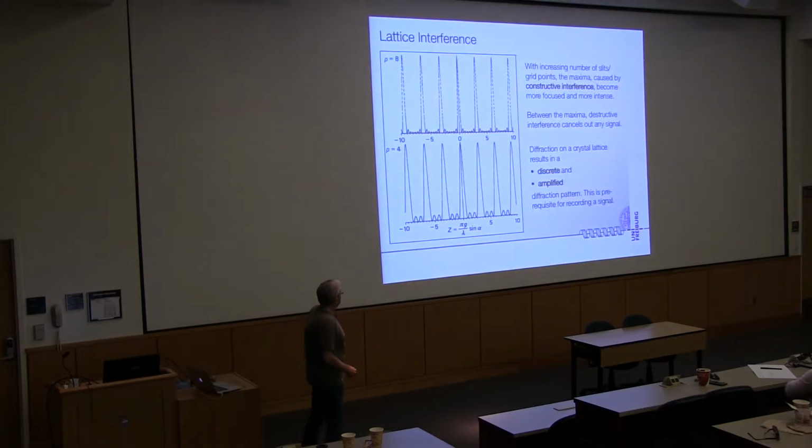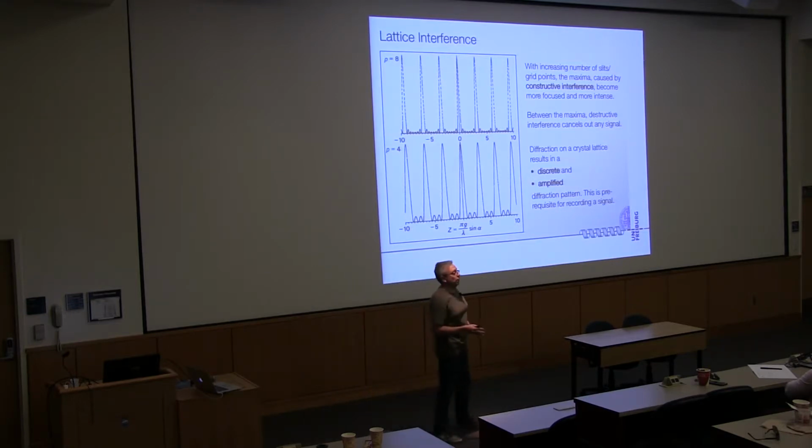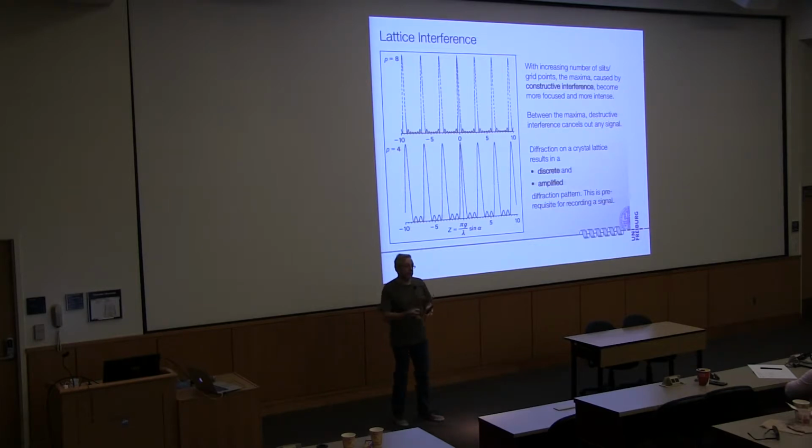And the reason for that is that if you diffract X-rays on a crystal rather than on a single molecule, you will have a parallel wave of X-rays hitting this entire crystal lattice where all those molecules are nicely arranged in different rows, and the scattered waves that emanate from these individual molecules then will interfere. And what you get is constructive interference and destructive interference.